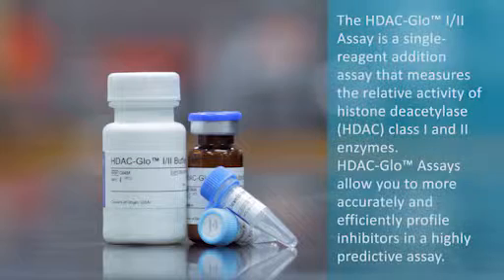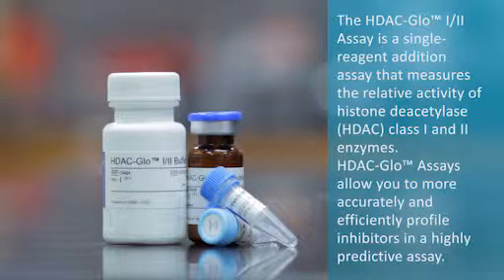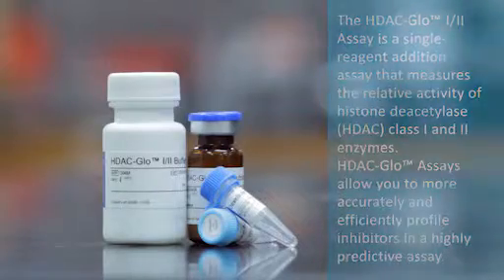The HDAC Glow 1-2 assay is a single reagent addition assay that measures the relative activity of histone deacetylase, or HDAC, class 1 and 2 enzymes. HDAC Glow assays allow you to more accurately and efficiently profile inhibitors in a highly predictive assay.